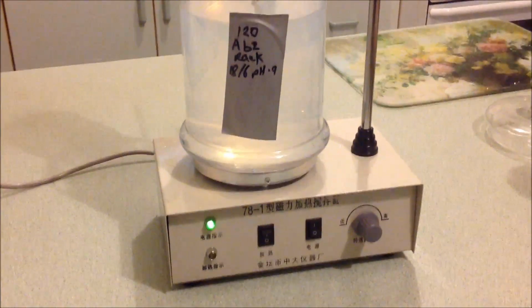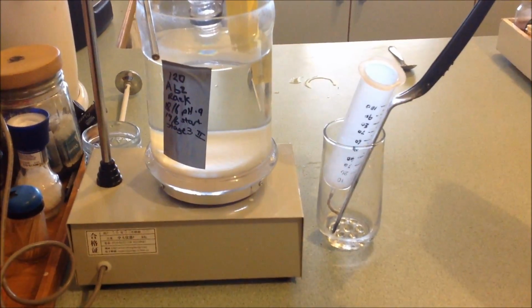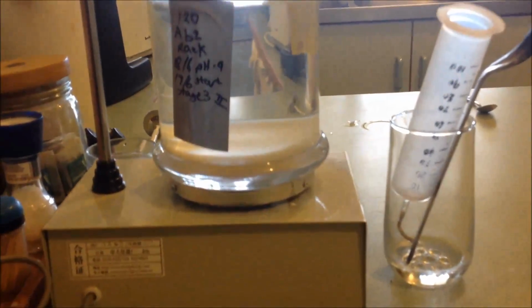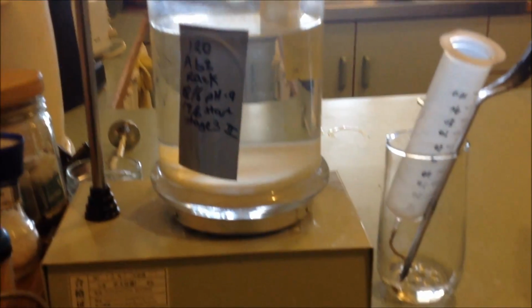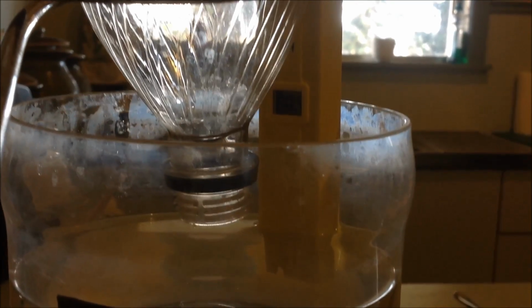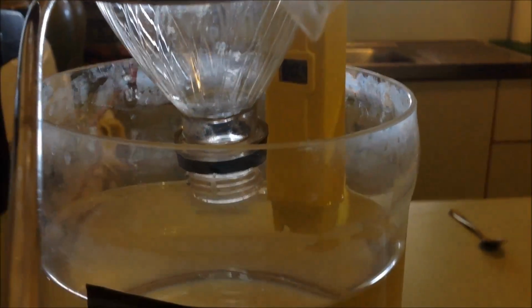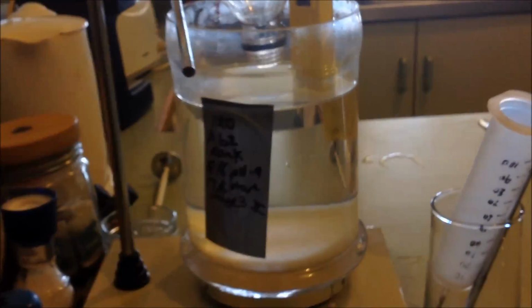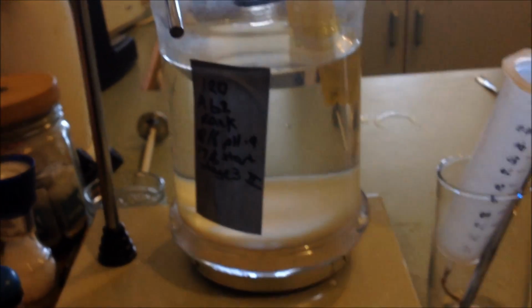So, what a pain. It looks good, but even though it's clear, we have overshot the mark. I was looking at it, it was pH of 6, it was starting to turn. Just went out of the room just a little bit too long and missed it. I don't know if you can see that. Anyway, it's sitting on 10.7, 10.4. Oh, there you go, that angle. So, nothing for it but to start again.